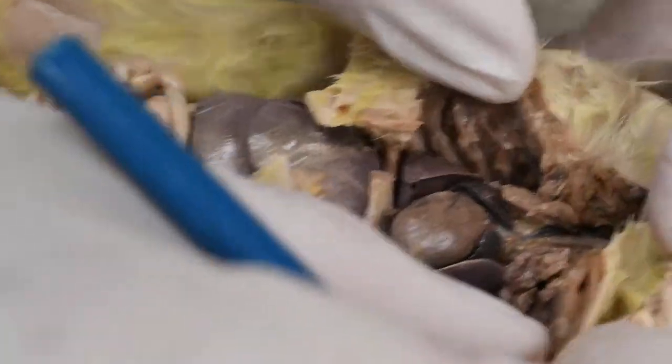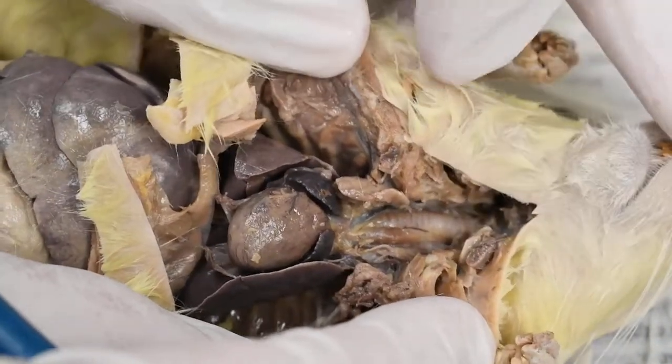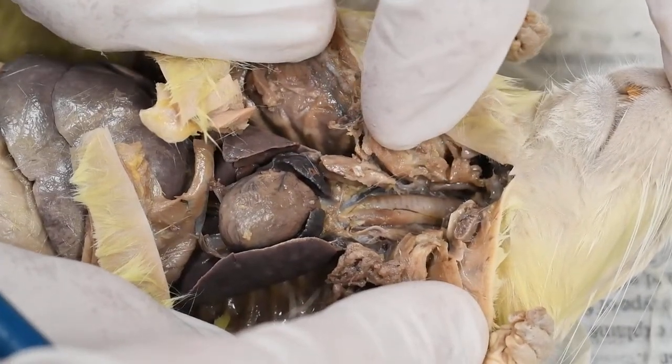Now, in front of the heart, it gets kind of difficult to see things without using a stereoscope. I'm just going to point out that tube you see running there with the rings in it.